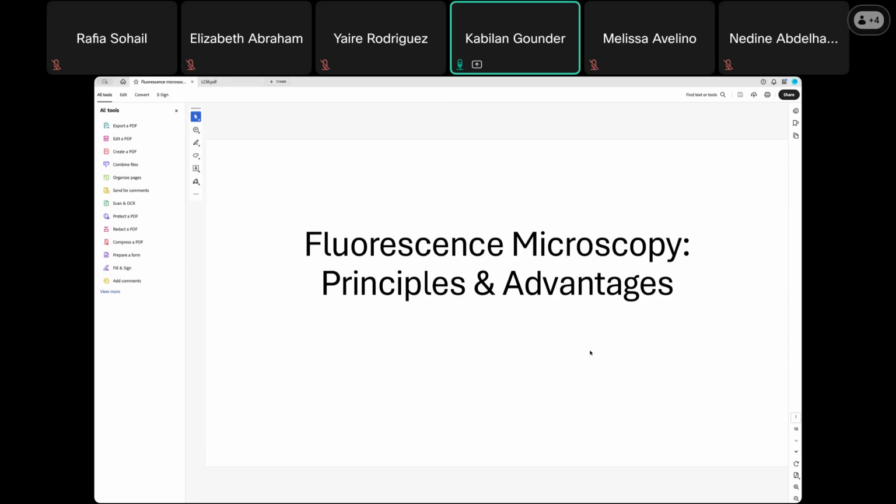So we are going to understand further, apart from the structural analysis, how the targets interact with each other, how abnormalities and other cellular events occur, the protein-protein interactions, and cellular trafficking. These are all the basic understanding we can get if we use fluorescence microscopy to get all these details.